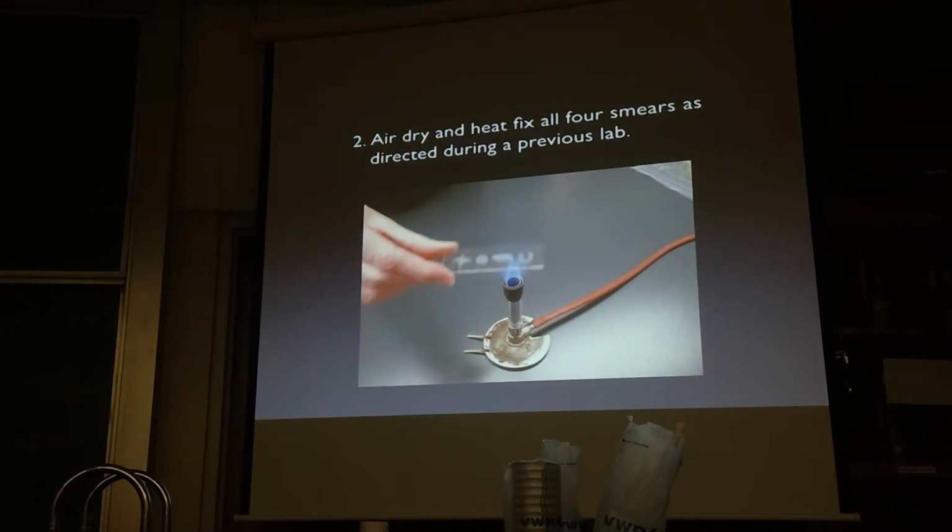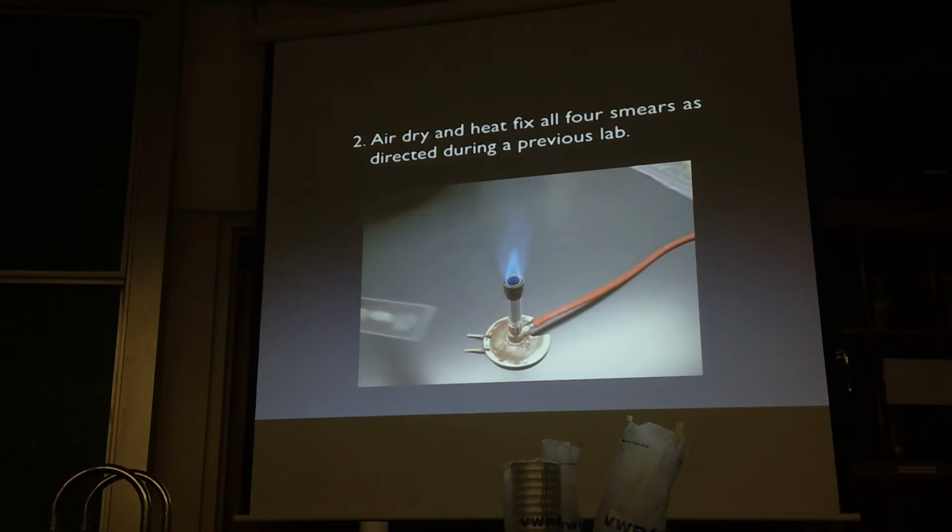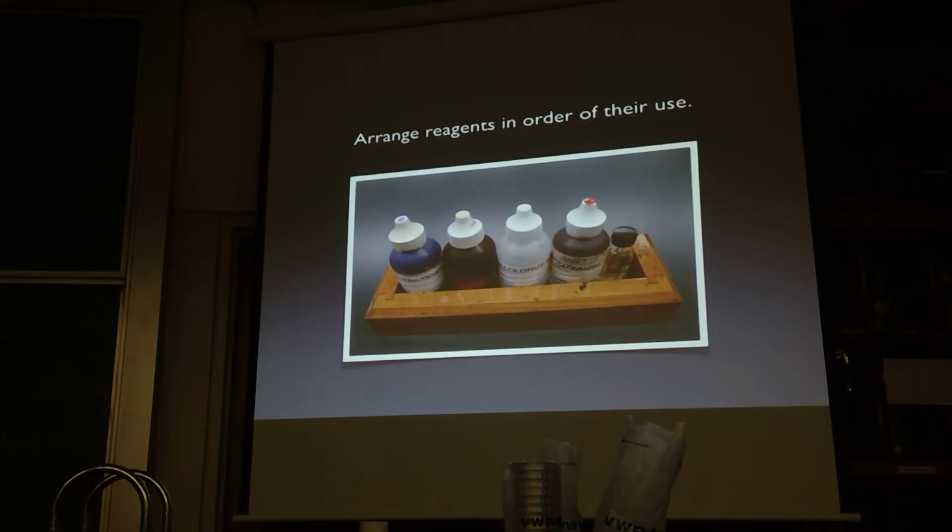Once, twice, 3 times. Now, if you can only hold on to one end of the slide, heat fix the 2 smears at one end, then turn it around and heat fix the 2 smears at the other. But don't hold it in there for a long time. We don't want to charbroil these guys.